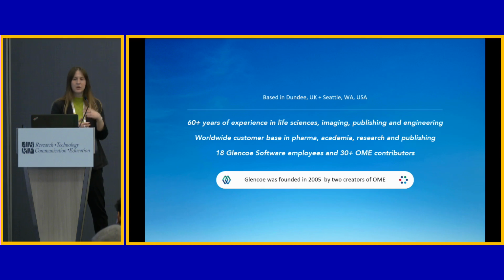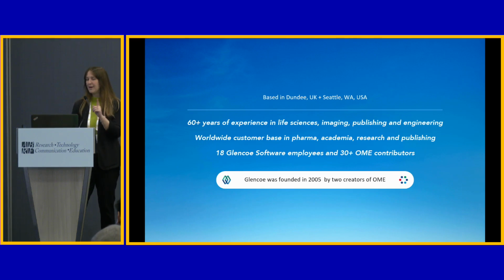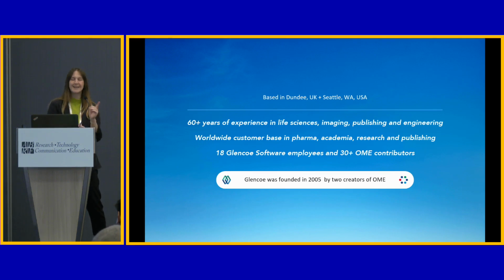So as I mentioned, we're about 20 people, and actually this slide I failed to update, so we're actually 19. We just had a new member join just 2 weeks ago, so we're 19 now, just approaching 20 people. But of course, because we're tied with this open source project called the Open Microscopy Environment, there's many more contributors to the solutions that I'll tell you about today that are not necessarily directly associated with Glencoe Software. And Glencoe was originally founded in 2005 by 2 of the creators of the Open Microscopy Environment.